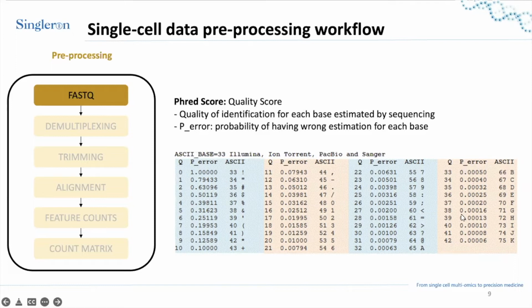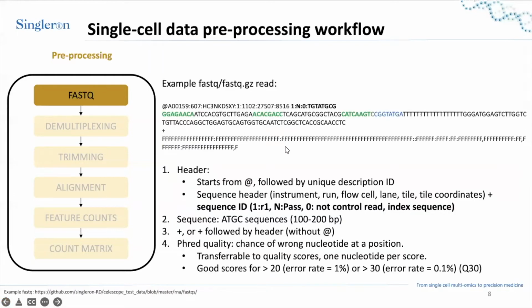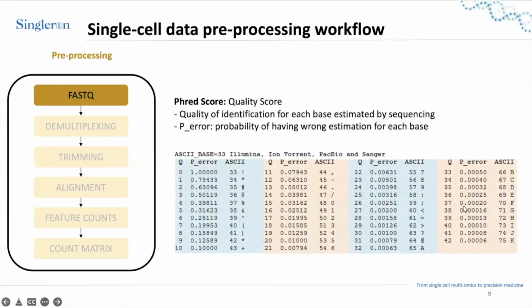So yeah, I saw there's a comment. Thank you for the comment, Mahab. Yeah, so here I think I meant the ASCII score. For example, from the previous slide, we see F. So F here means the error rate of 0.0002, which means it's a relatively small error rate.